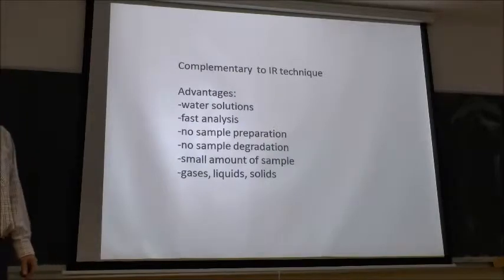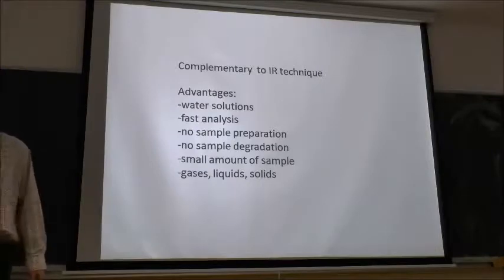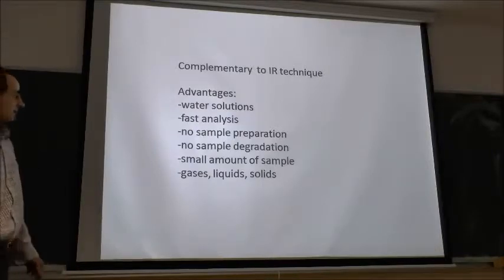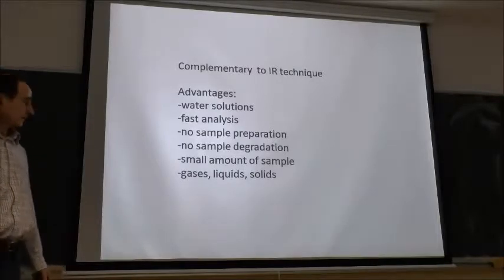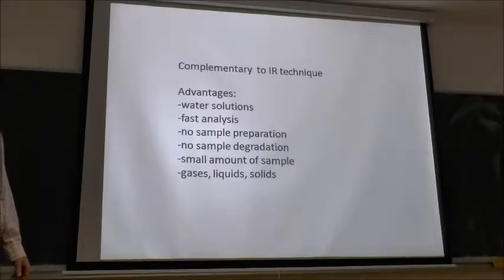So Raman spectroscopy is complementary to IR technique, but it has some advantages over it. You can use water solutions as a sample. The analysis is pretty fast. There is no sample preparation, no sample degradation. You can use small amounts of sample, and samples can be liquids, gases, or solids.